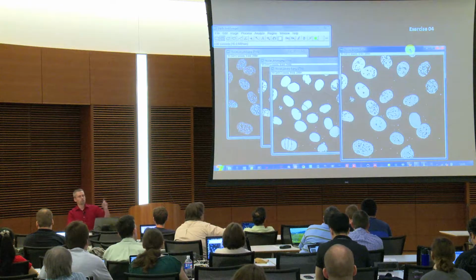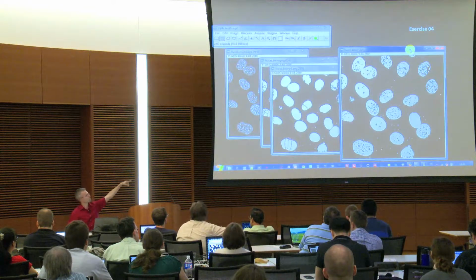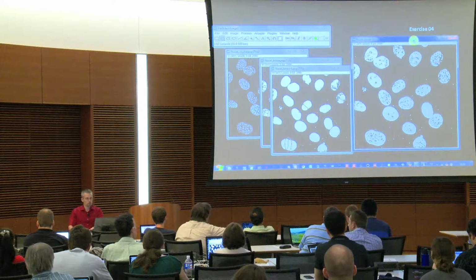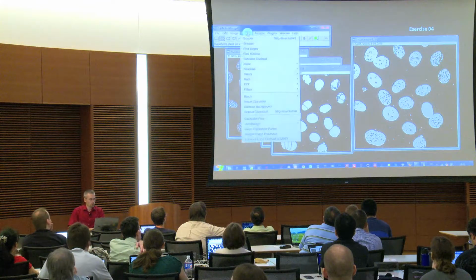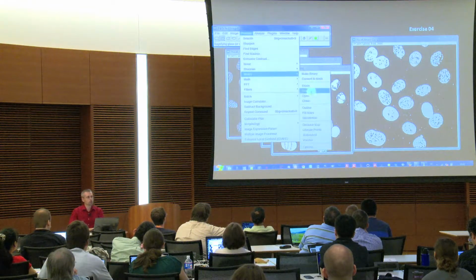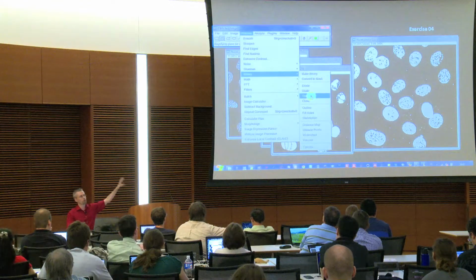Now you have seen we have this closing and opening function where we can also deal with those kind of hole things. So first, I'll do that here on a copy with the normal ImageJ function. This means I go to process, binary, and you see them listed here already, but that does it only as it is set in the options, so it does it normally one time.